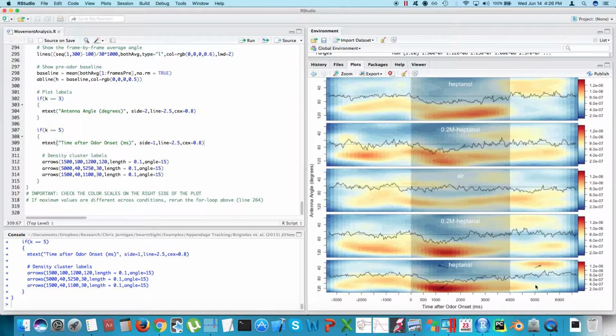One other interesting thing we noticed is that, for example, in this last odor, there's this other little area of clusters, which seems to be related to how concentrated the odor is. Notice how this was a pure odor, and this cluster seemed to happen later. So it's almost like, at first it reaches away from the odor, but then after the odor is gone, it goes back to the front to check it, perhaps.